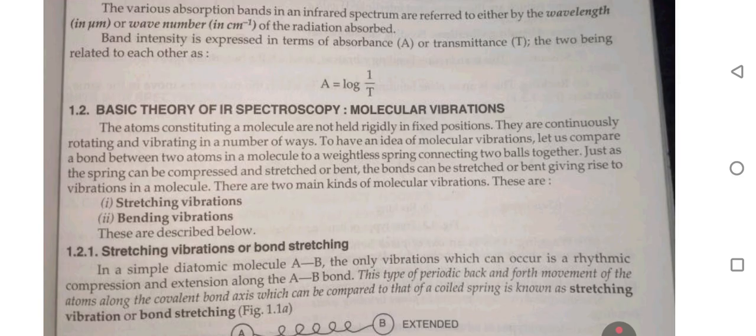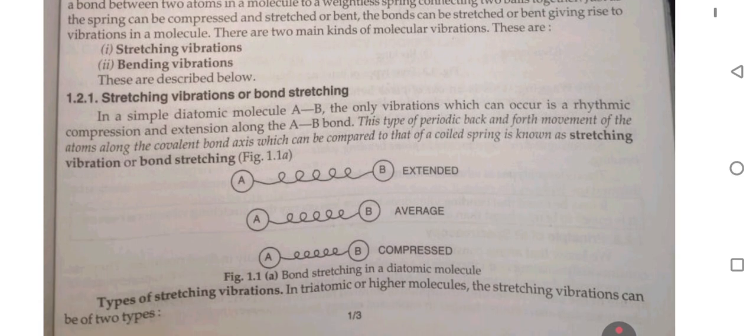There are two main kinds of molecular vibration. These are stretching vibration and bending vibration. Stretching vibration or bond stretching. In a simple diatomic molecule AB, the only vibration which can occur is a rhythmic compression and extension along the AB bond. This type of periodic back and forth movement of atoms along the covalent bond axis, which can be compared to that of a coiled spring, is known as stretching vibration or bond stretching.